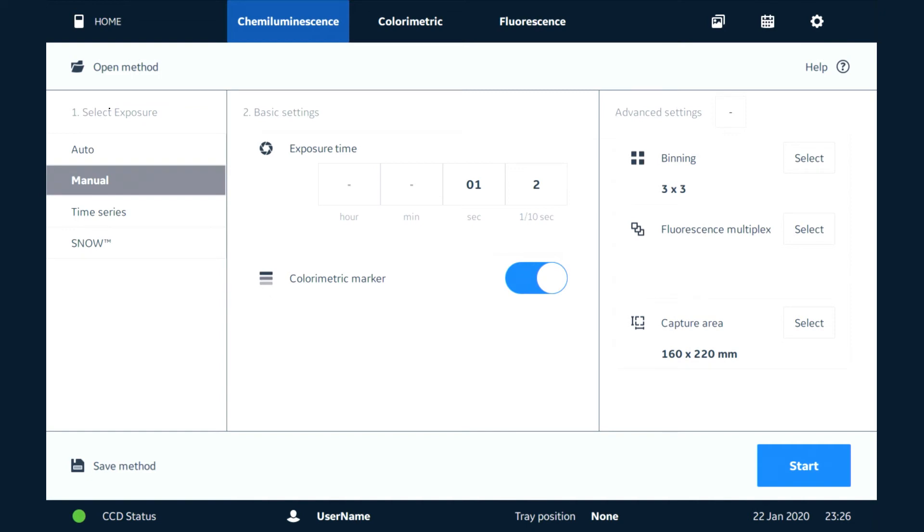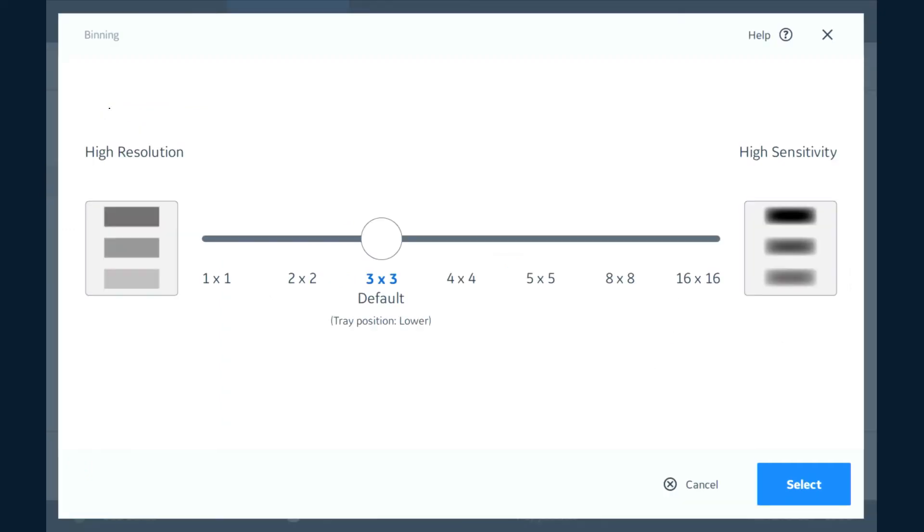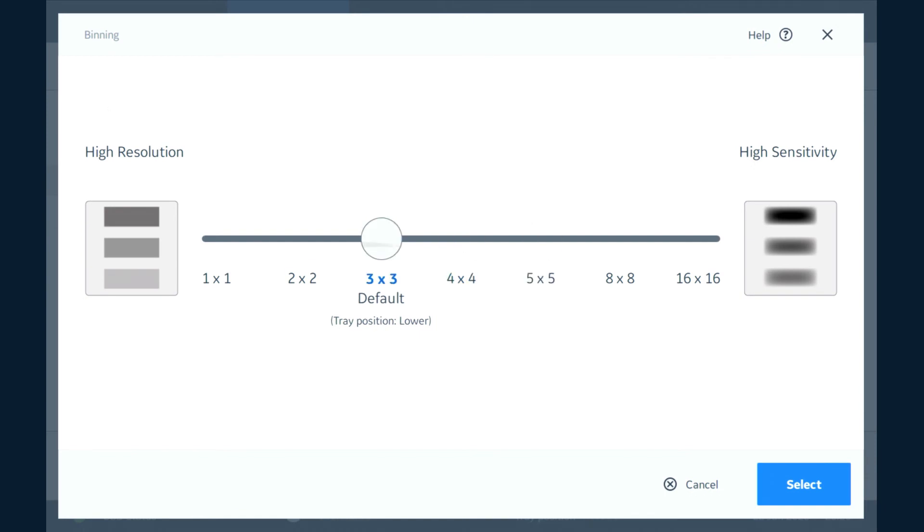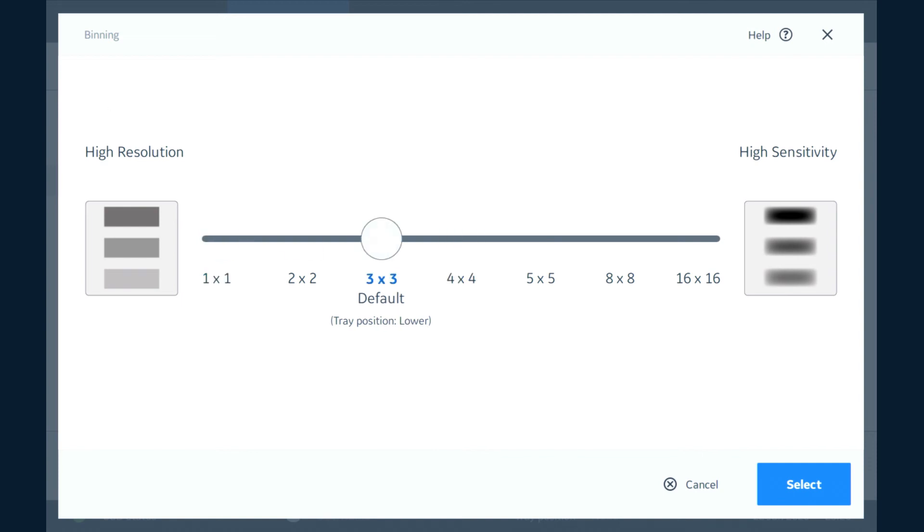If we're in this mode here we can go to binning. This is how much our image is binned and we can alter this to either a higher setting or a lower setting. The recommendation is to default, but sometimes due to speed or just checking you might want to use one of the different resolutions versus sensitivity as you see here.